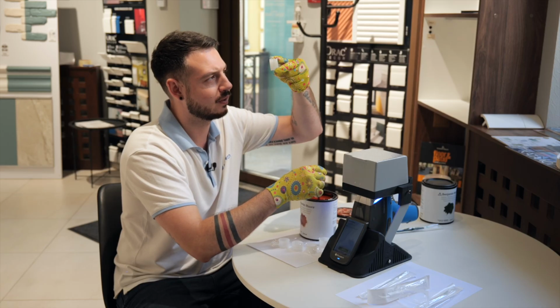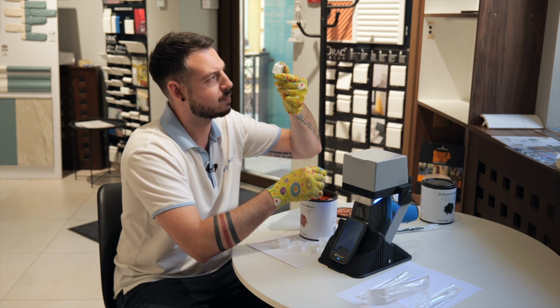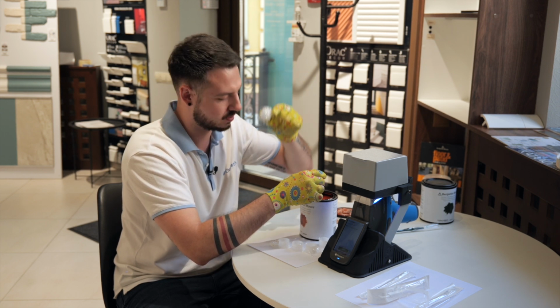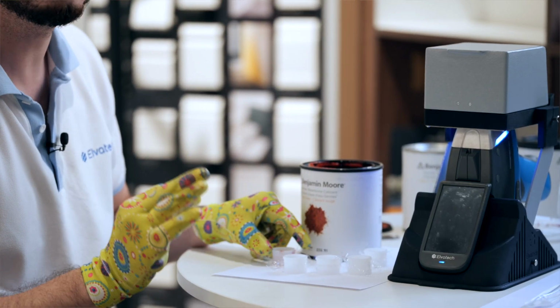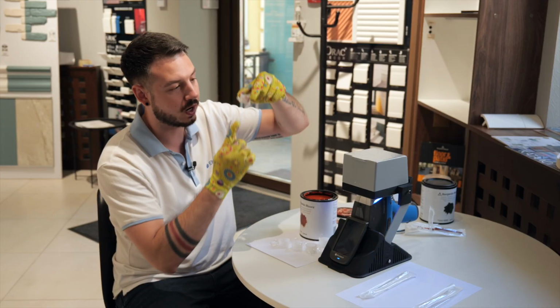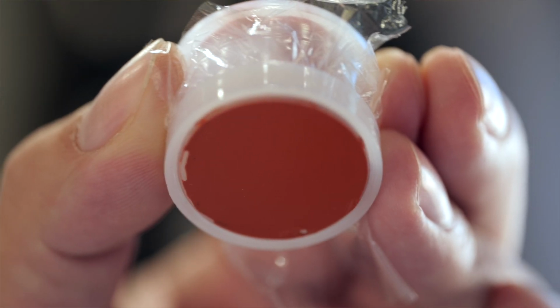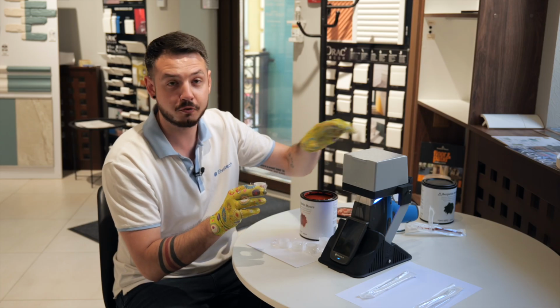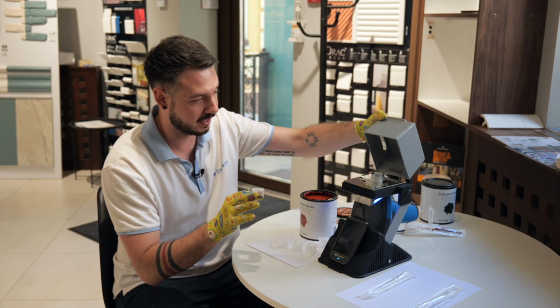So making sure that the protective film is positioned correctly and it's fixed. So we can use this sample cup, and the same, we pour just a little bit to cover the measurement area. So if you close it all, you will perform the correct measurement, correct analysis.